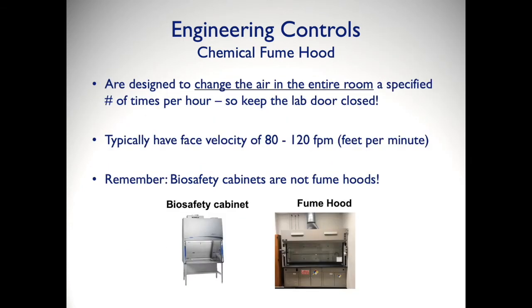Fume hoods are designed to change the air in the entire room a specified number of times per hour. So, it is helpful to keep the lab door closed at all times. Typically, they have face velocities of 80 to 120 feet per minute. Remember, biosafety cabinets are not fume hoods.